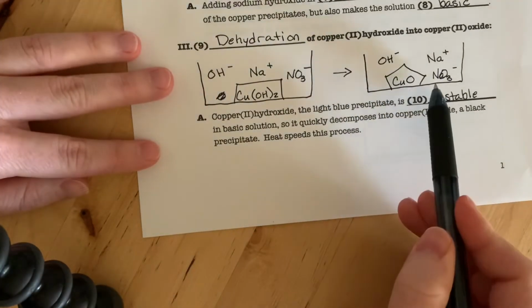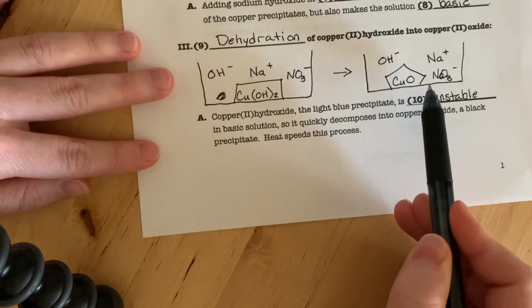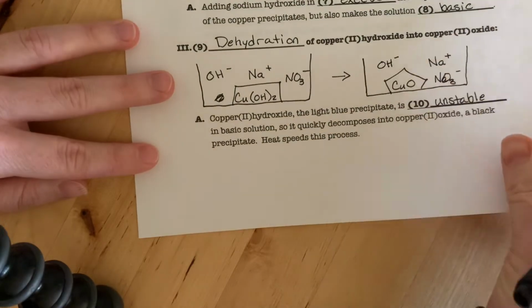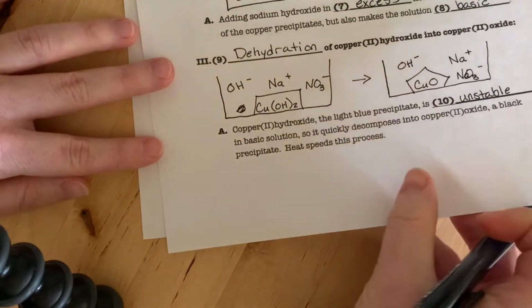So after this reaction, one thing you need to know, which you'll see in the experiment, is that you're going to pour off the liquid. And you're going to be asked some questions about what you're removing when you pour off the liquid. So when you write your next principal species in solution, take that into account, the fact that you poured that off.